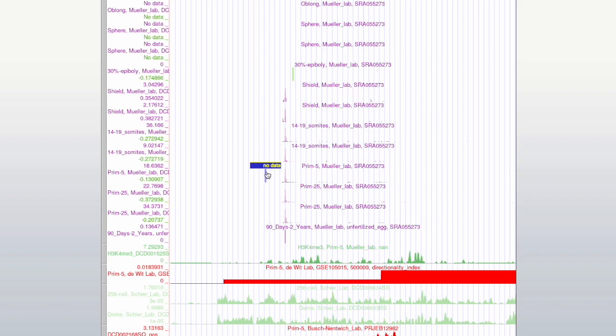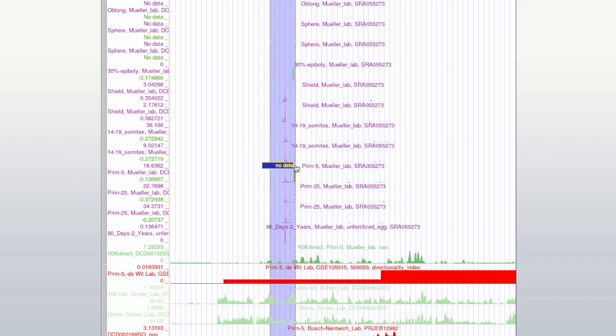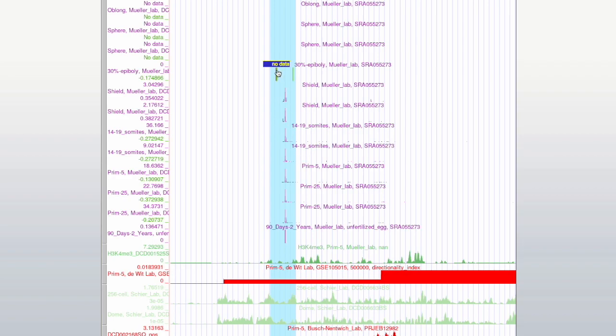The CAGE peaks in the promoter region start around here, which is according to the track label, the shield stage.